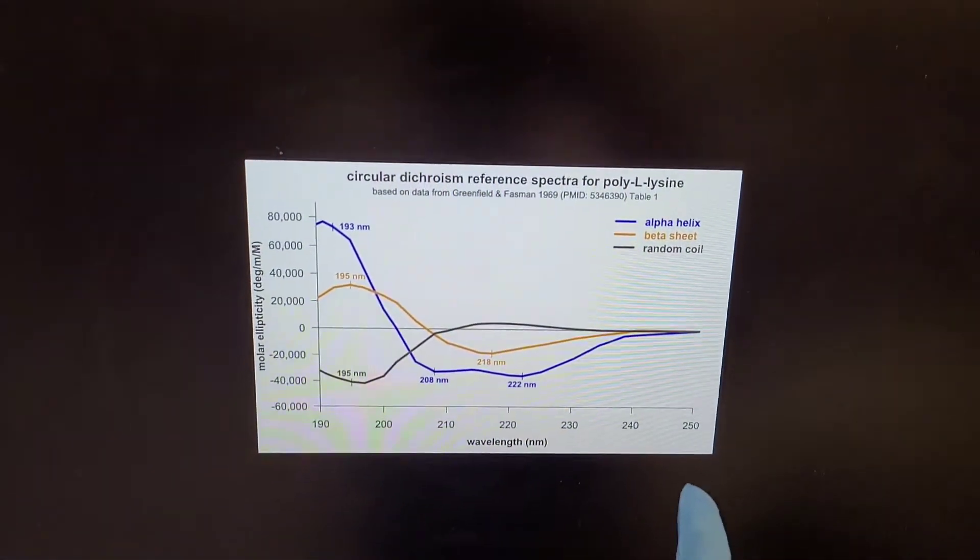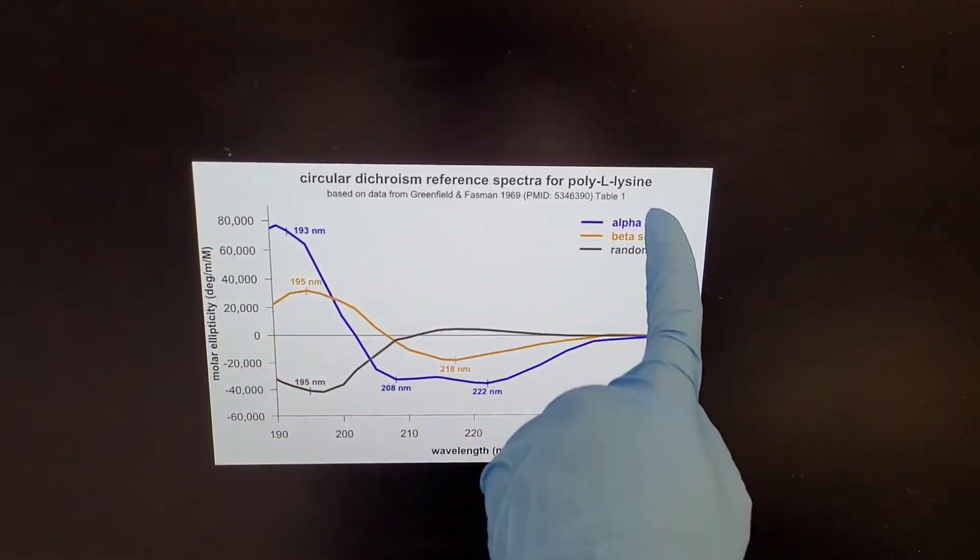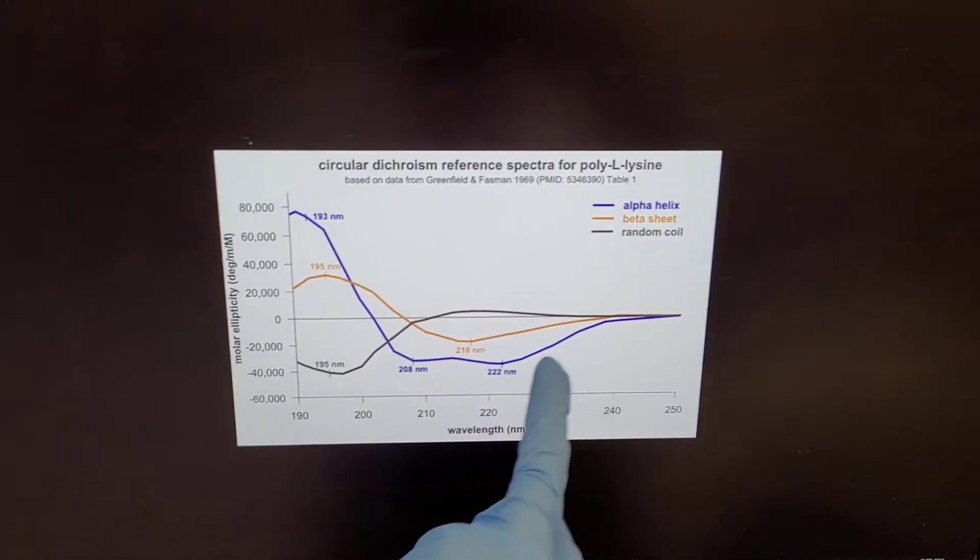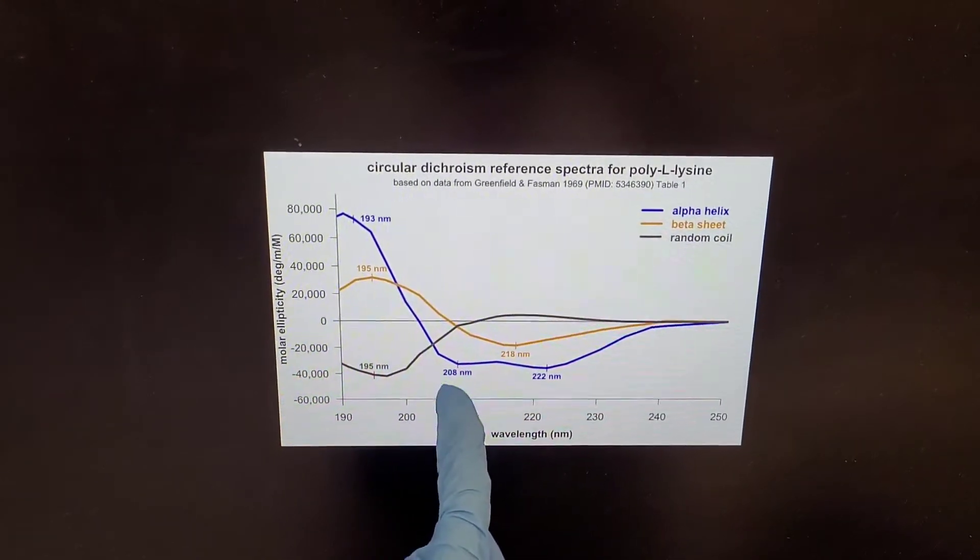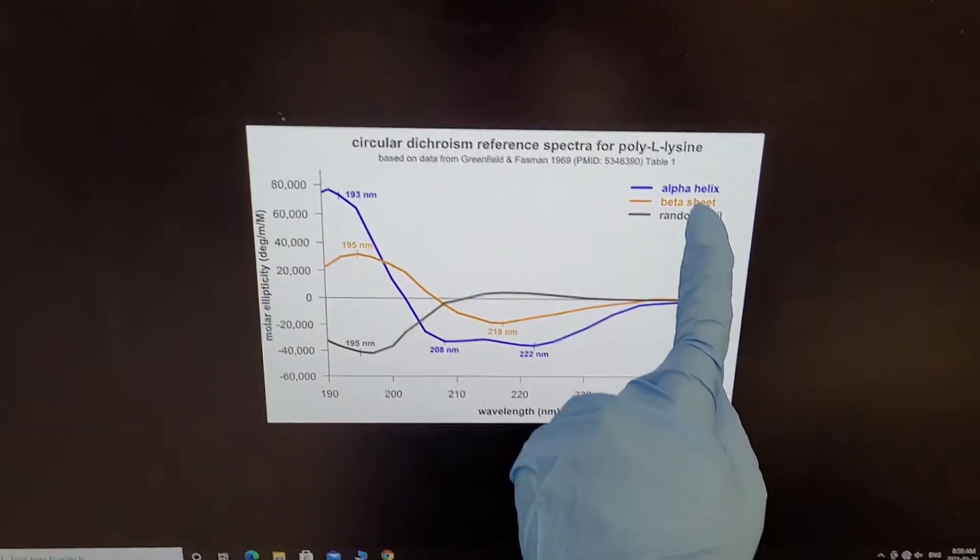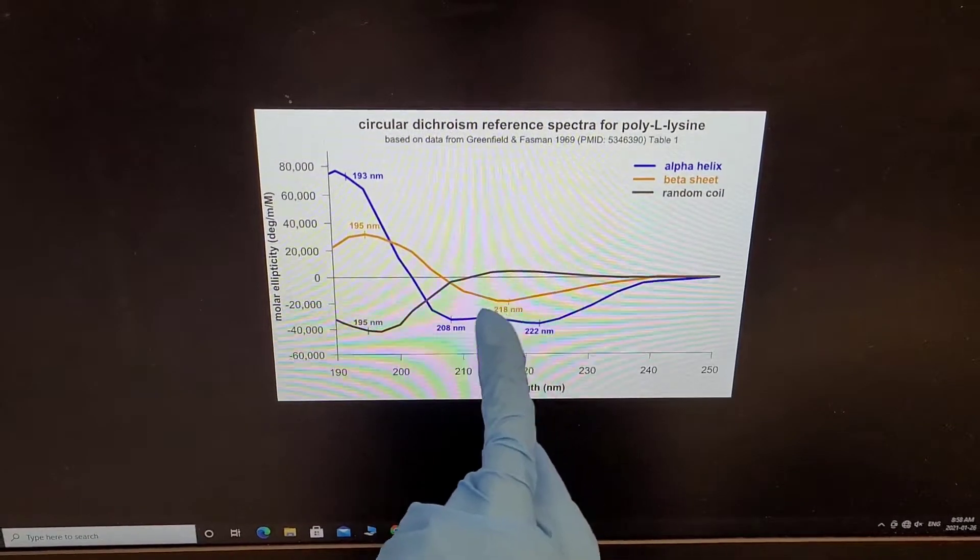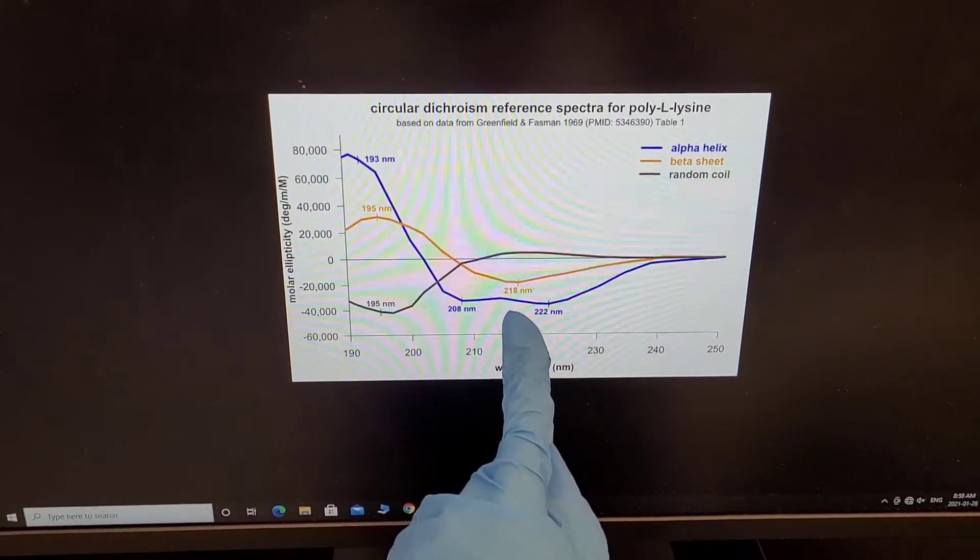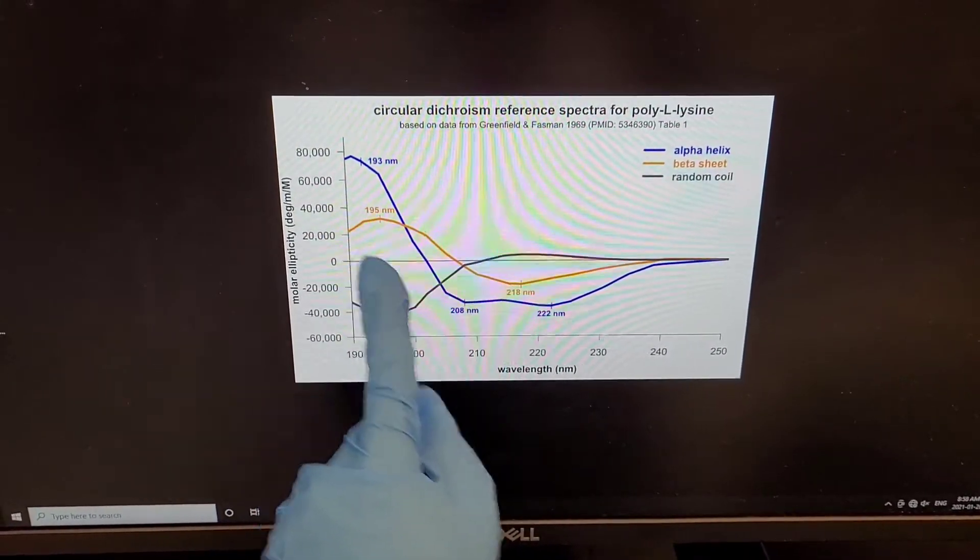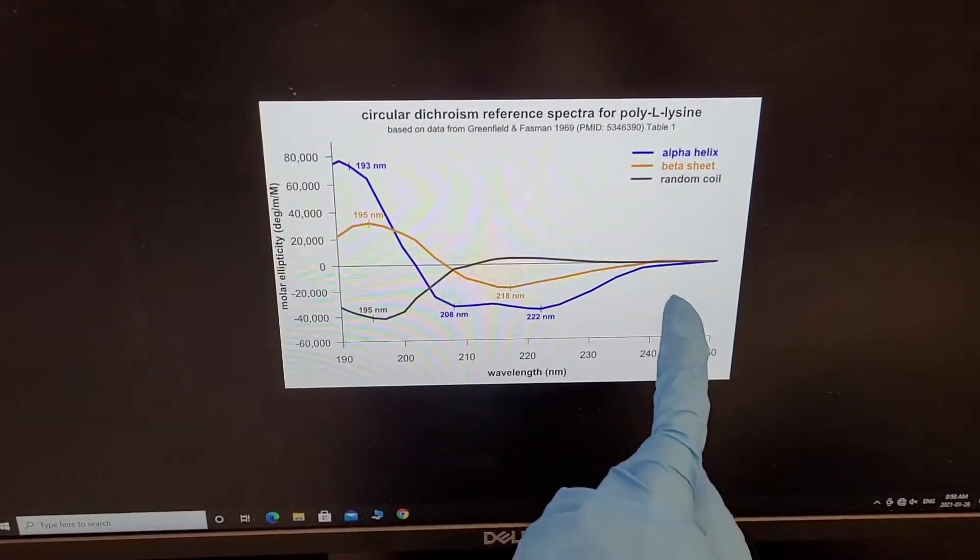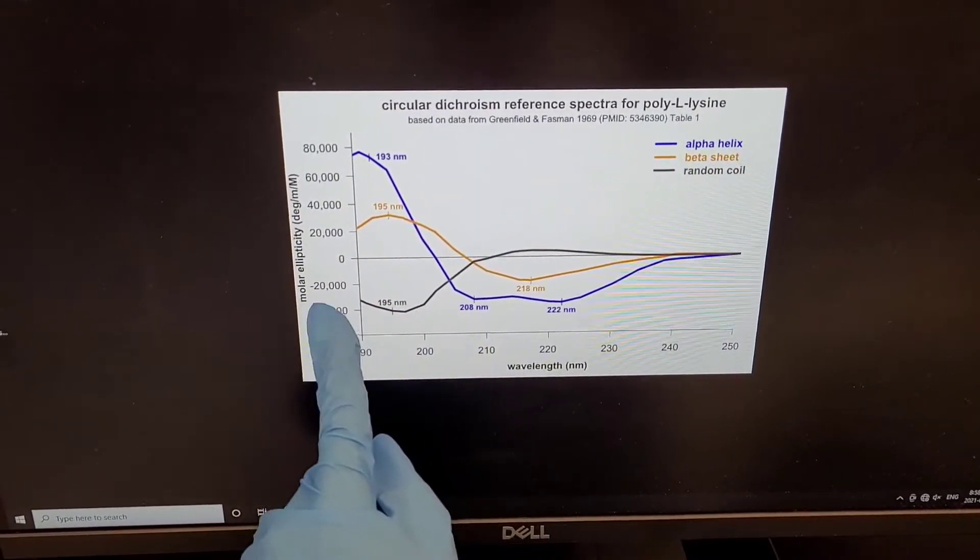If your protein is alpha helical, you will get the blue curve. You get two distinct peaks here. If it is beta sheet, you get just one peak at 218 nanometer and looks like this. And a random coil, it looks completely different.